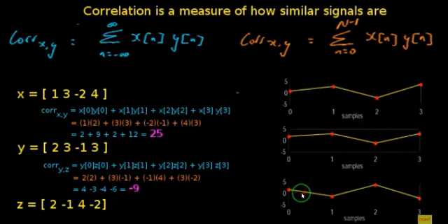Okay, but how about this one? You see here that instead of the increase that we had here, we have the decrease, and instead we have the increase here and again the decrease. It's something exactly the opposite of what we had seen here and here. Okay, so this signal must be different from these two. But how can we quantitatively show that these three signals are similar or different compared to each other?